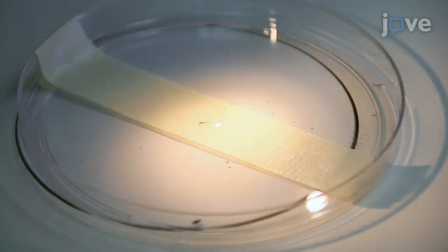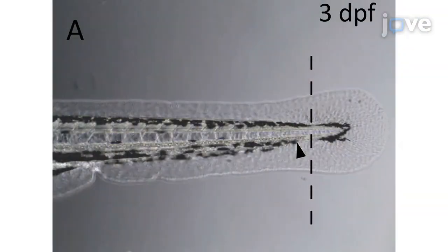To avoid bleeding and ensure survival of the larvae during fin clipping, the transection must occur precisely.